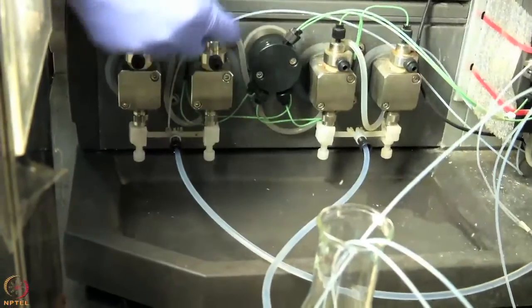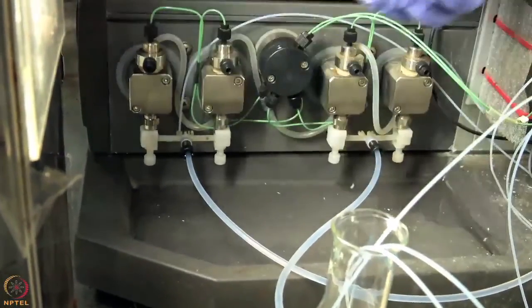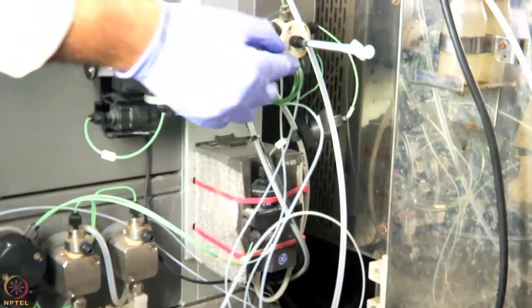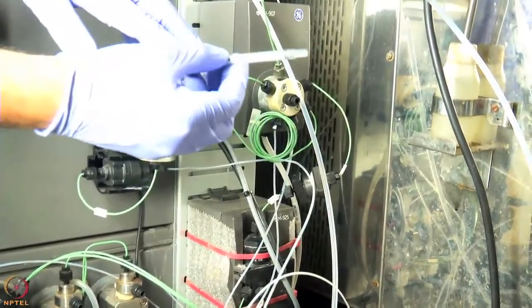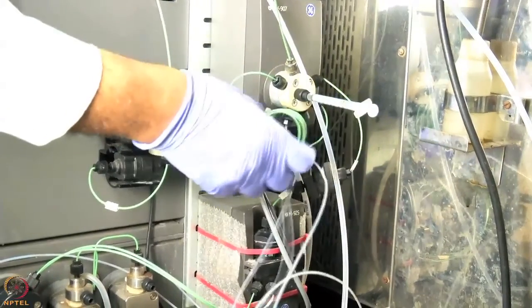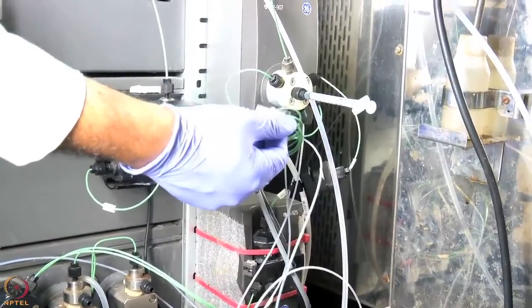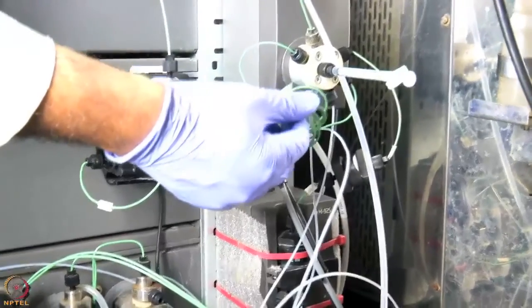Once we start, the buffer will come from here and go here, where the buffers mix. Here is the injection valve, where we can put our samples. If we have a very small amount of sample, we can take the sample and put it into the injector valve, and this is the loop. The capacity of this loop is 500 microliters. If we have a larger volume of sample, we can use a 10 ml or 20 ml loop.